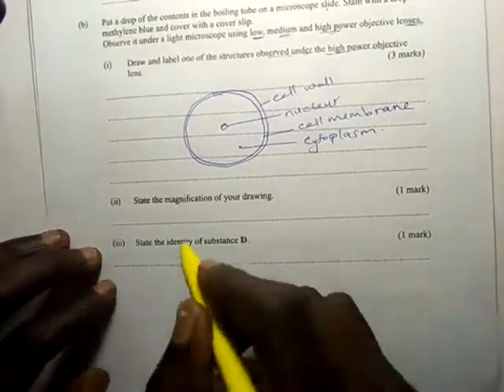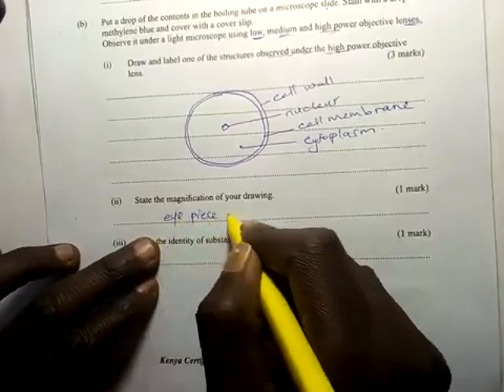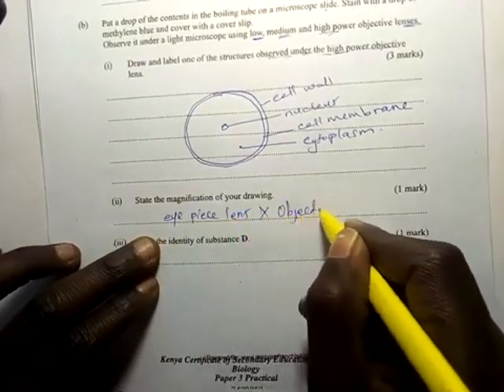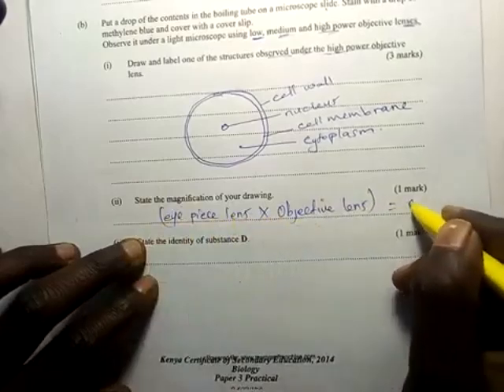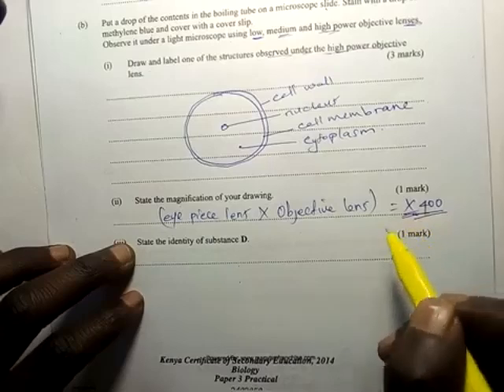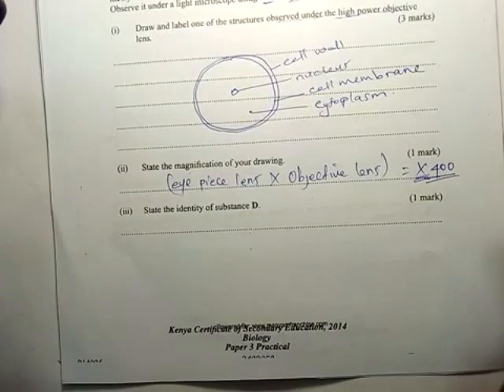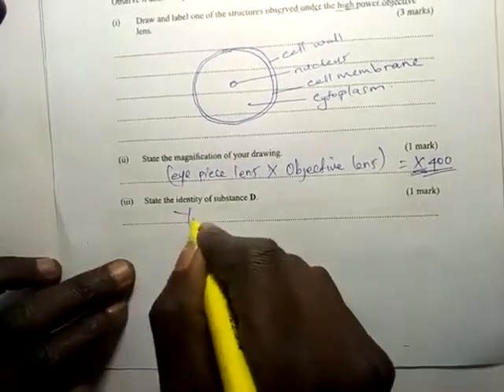Now state the magnification of your drawing. The magnification, you will multiply the eyepiece lens by the objective lens in order to get the magnification, which is times 400. The answer should have a times sign, a multiple sign. Identify substance D. State and identify the substance D. Now here, substance D was the yeast.